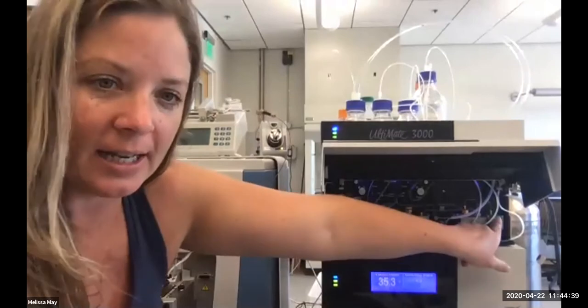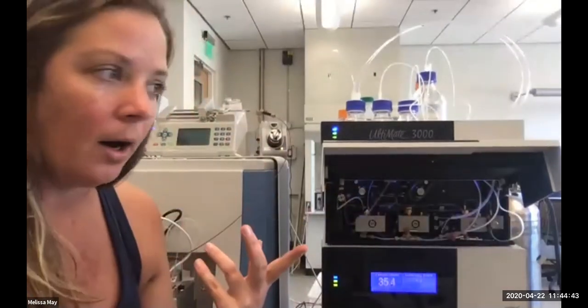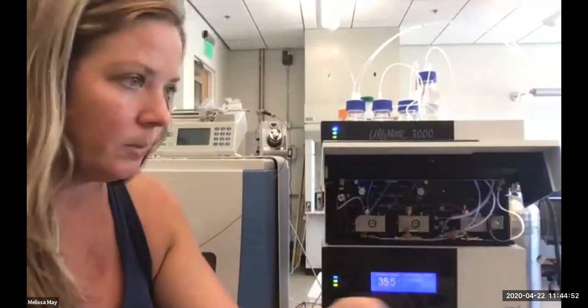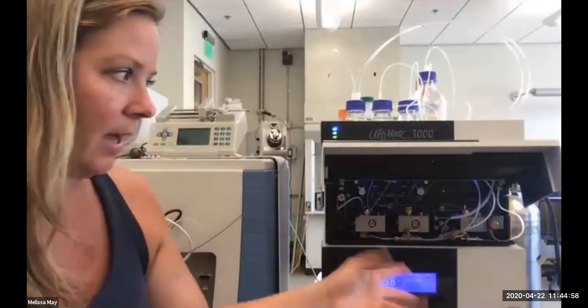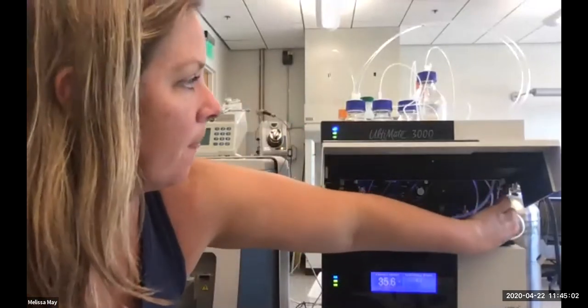This over here has a little vial on it that you will unscrew if you are purging the valves. And so if I wanted to go through and purge, because this pump is off, it doesn't matter, I unscrew this. I would tell the instrument that I wanted to purge the loading pump. It would ask me to ensure that the valve is open, and I would say okay, and then it would start pumping air through to try to get any bubbles out of the system.